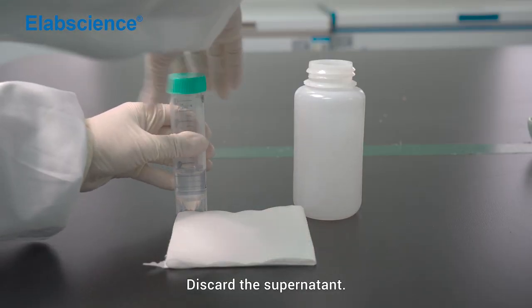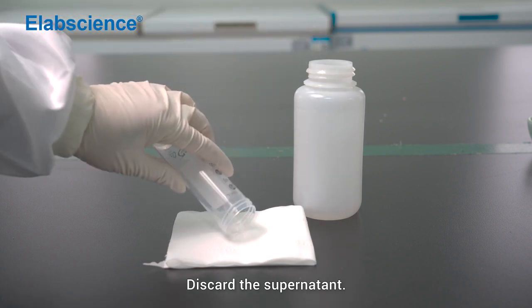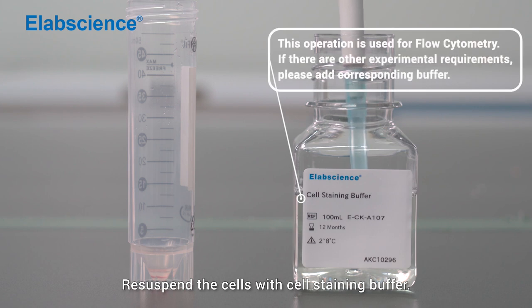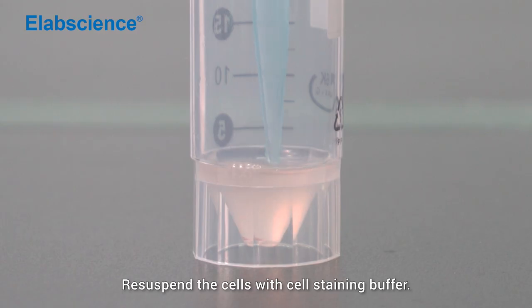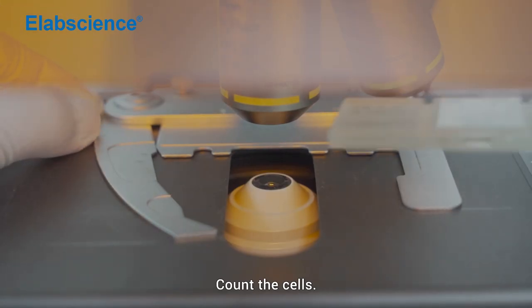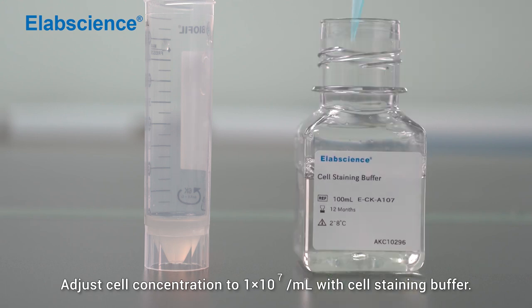Discard the supernatant. Resuspend the cells with cell staining buffer. Count the cells and adjust the cell concentration to 1×10⁷ per mL with cell staining buffer.